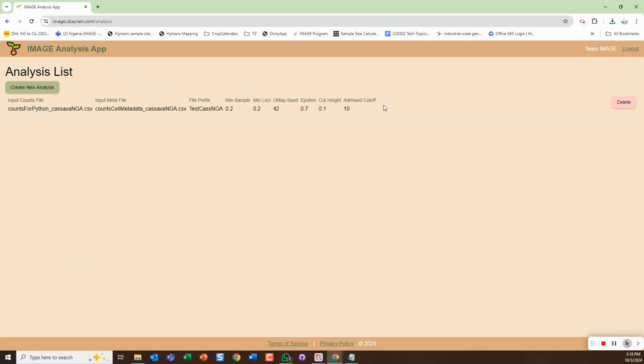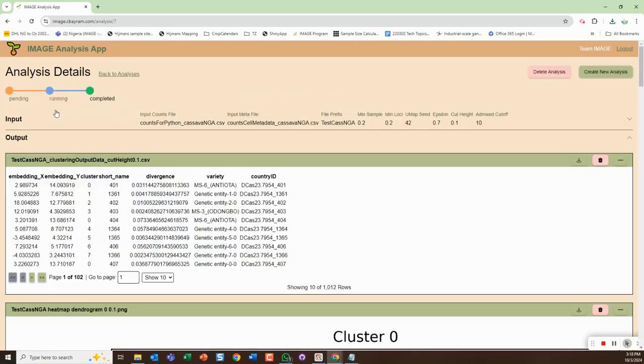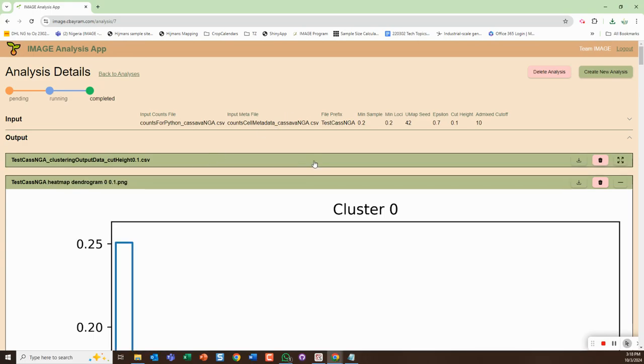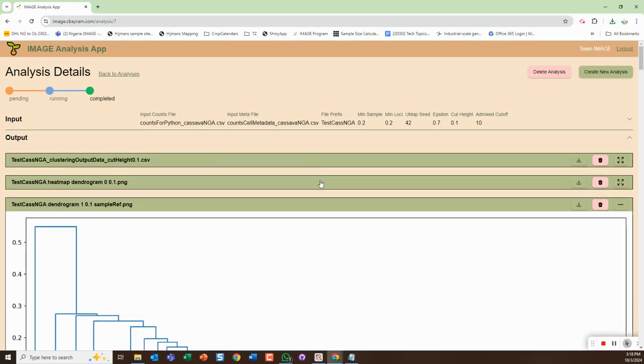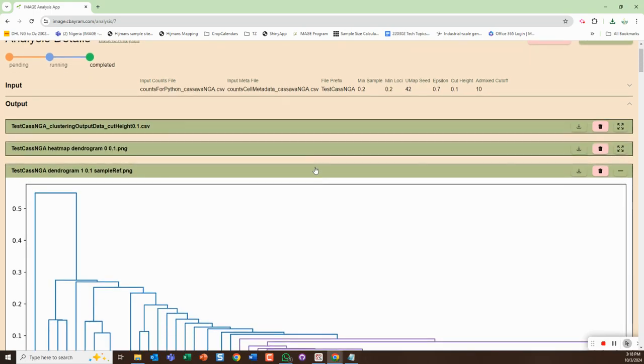So I could create a new analysis, I can modify these parameters or modify the input files so that I would get a new output. And then if I want to go back I can just click on this and it'll take me to the results for the analysis that I ran.